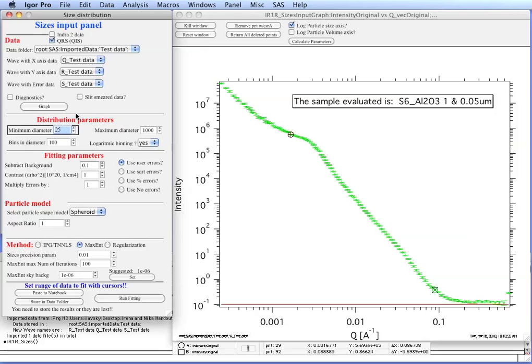Now we can make a minimum diameter, leave it on 25 angstroms. This maximum diameter we have to increase because this is 100 nm - we need more. Let's add one more zero to push it to 1 micron. The number of bins is fine. When you study such a wide range of sizes, you actually need logarithmic binning for the d-spacing sizes. The background - you can see that's the red line here - needs to be slightly higher because all the green points here are mostly above it. So let's click a few times and increase it so it crosses most of the green points here. That represents the flat background in the small angle scattering data.